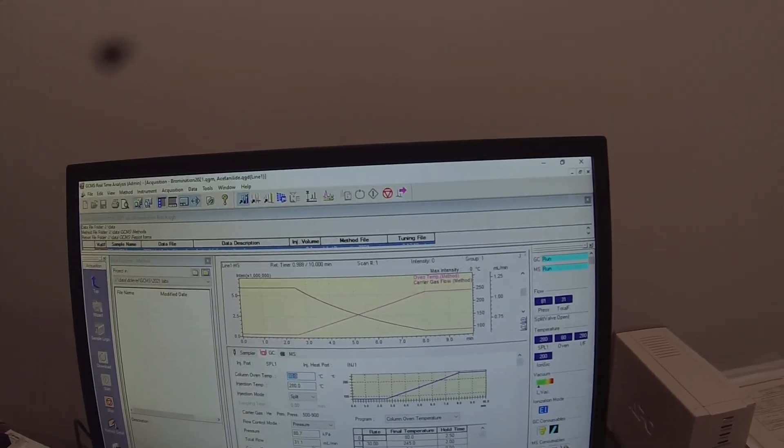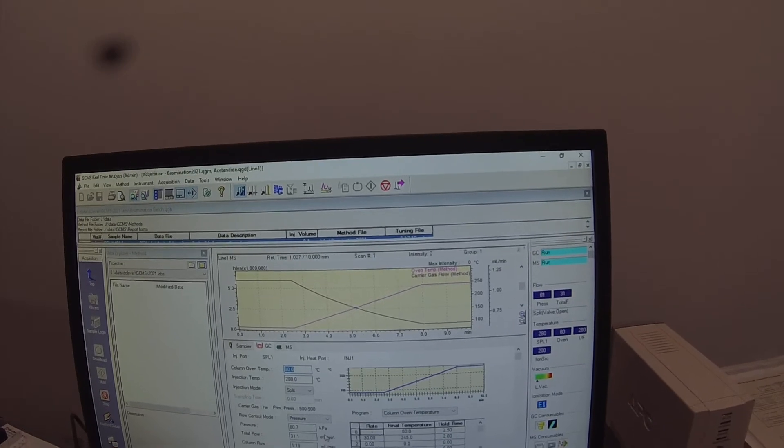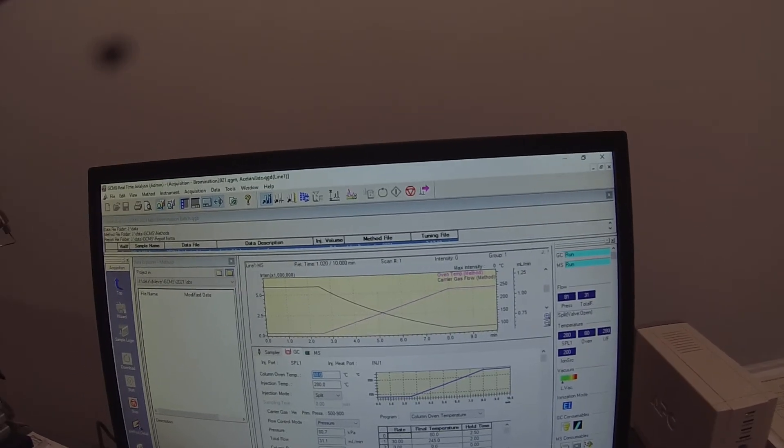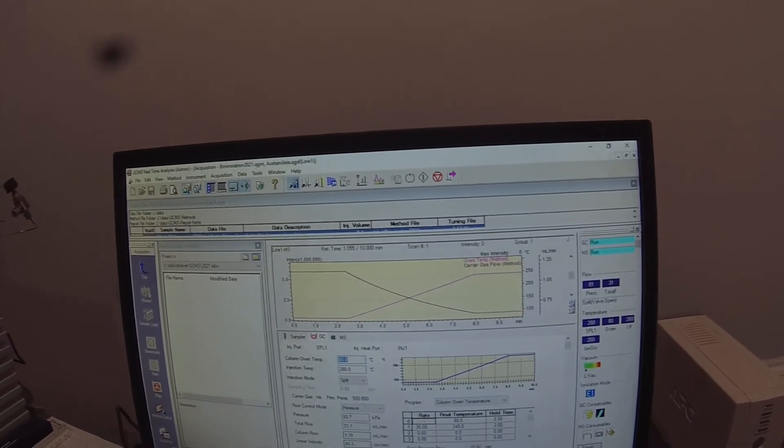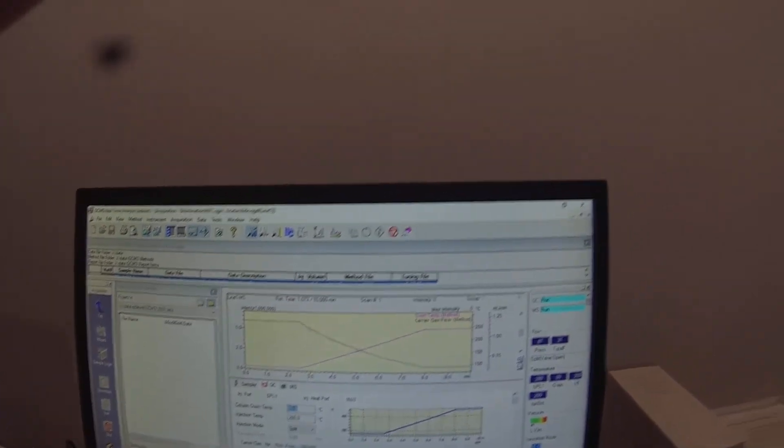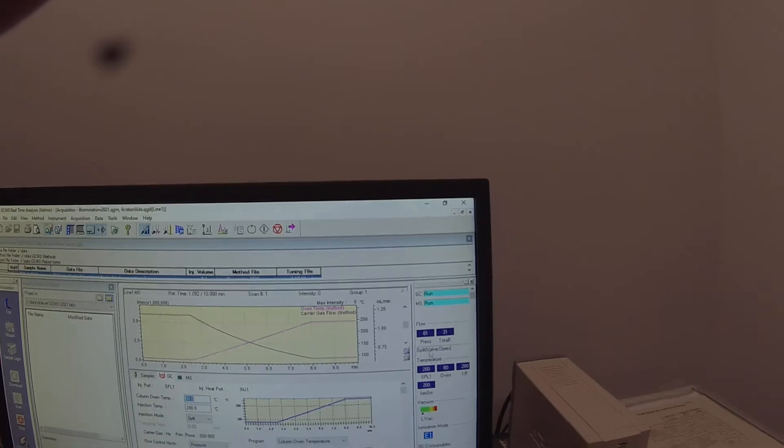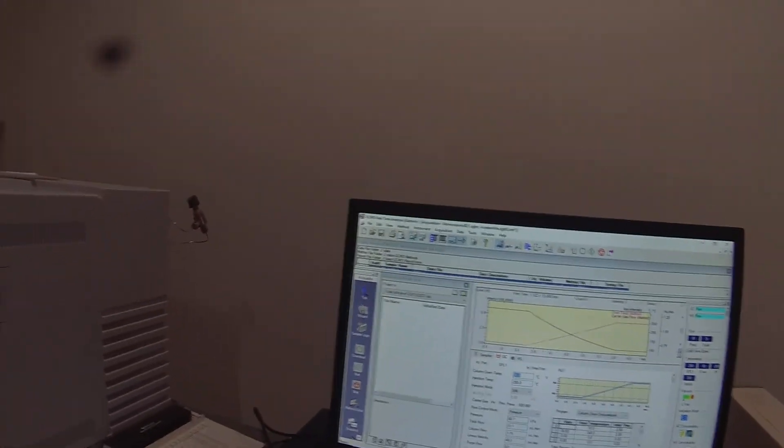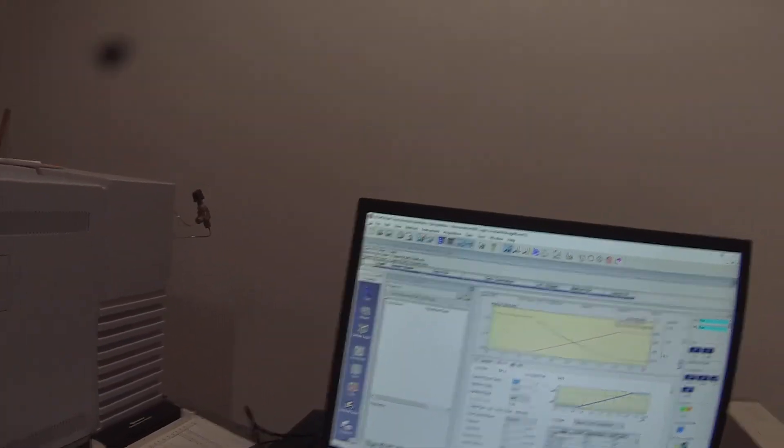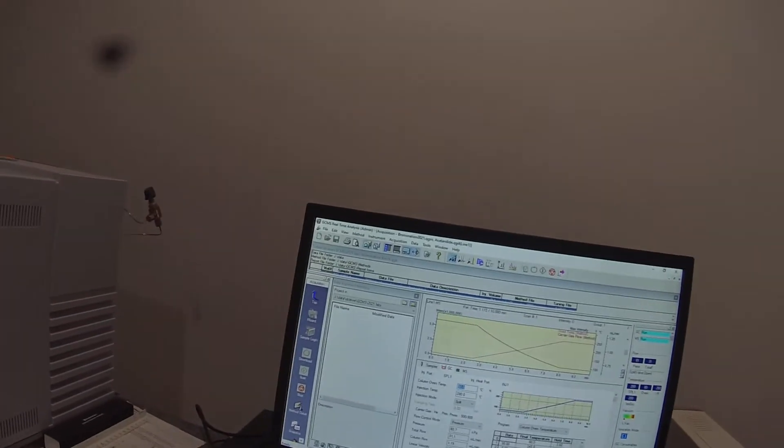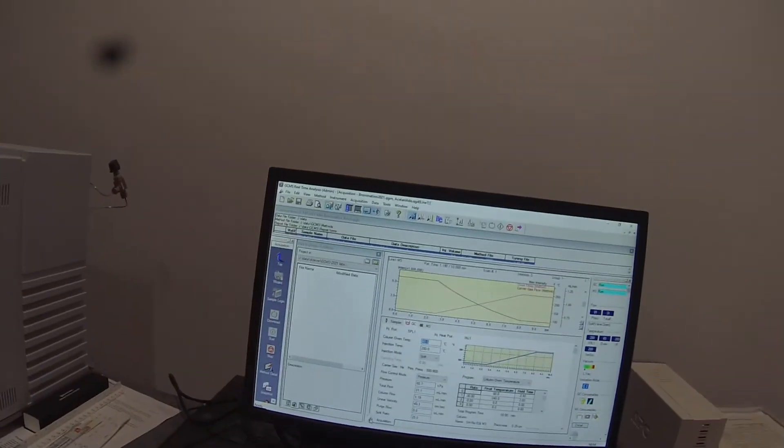That's 31 milliliters per minute total flow but only 1.19 milliliters per minute column flow because of the split. So you can get that data over here as well.